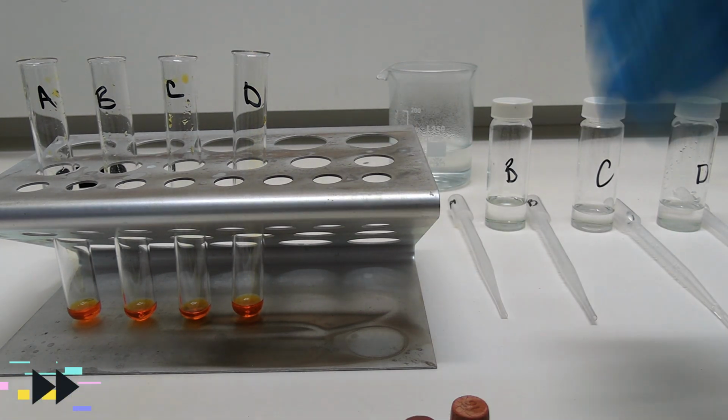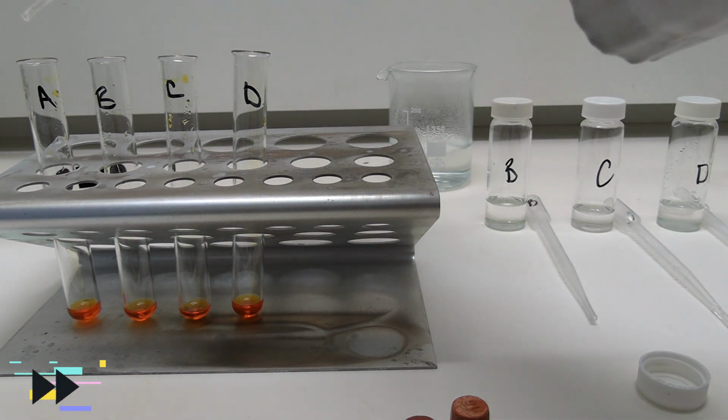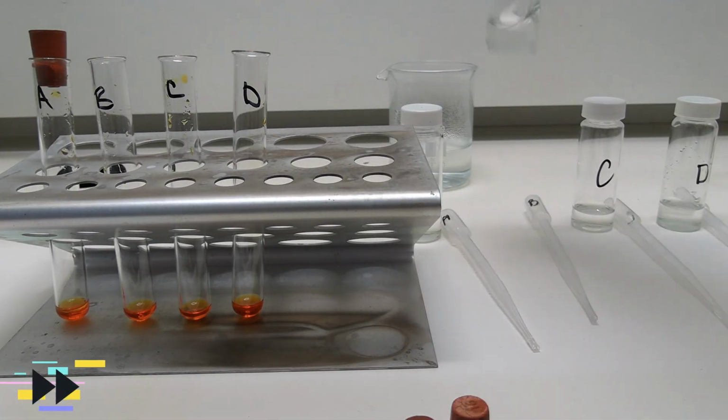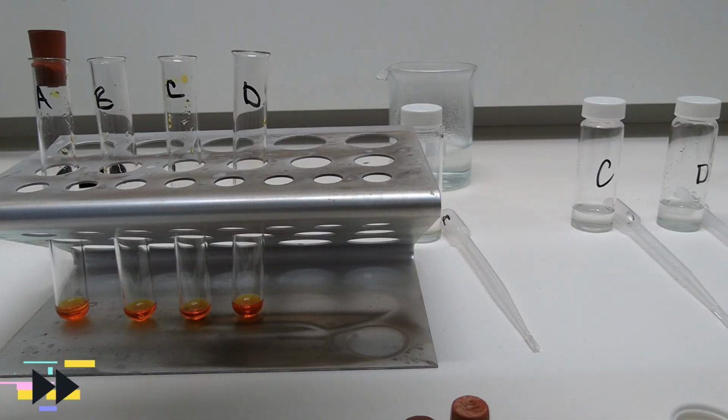You'll then add just a few drops of your samples to their corresponding test tubes. Just as before, making sure to cover them again after each addition.